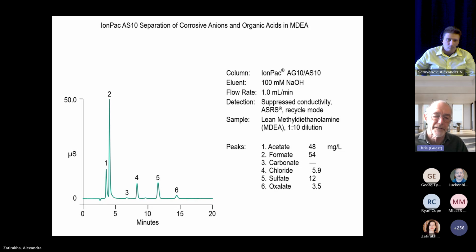So at higher concentrations, the monovalents and the divalents have more similar selectivity.